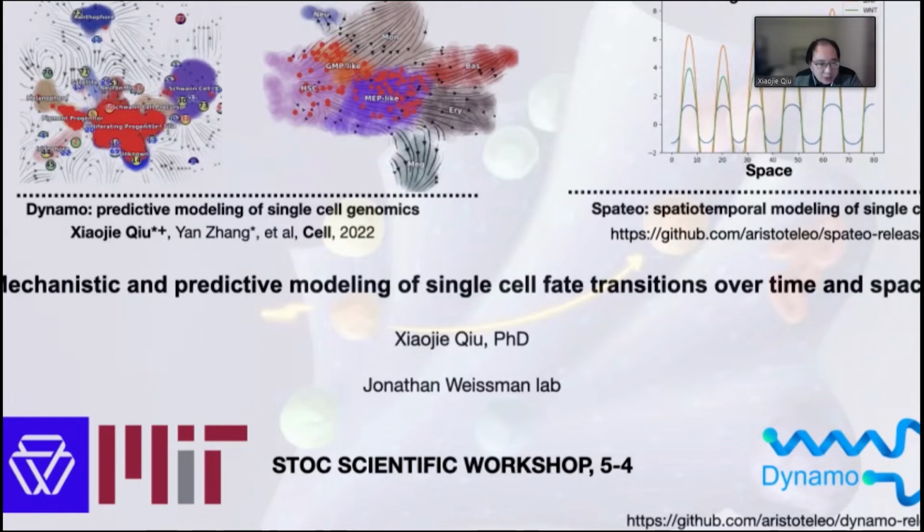So for today's talk, I'm going to tell you my story on Dynamo for predictive modeling of single-cell genomics. In the last few minutes, I'm also going to briefly talk about another story on Spateo, a new toolkit developed by me, BGI Research and others for quantitative modeling of spatial transcriptomics.